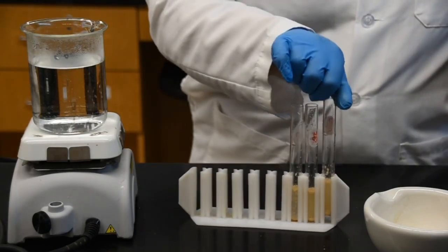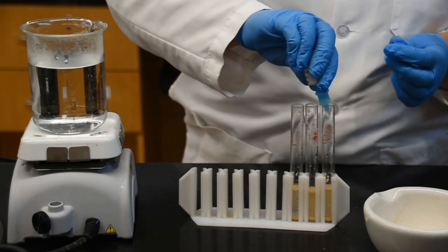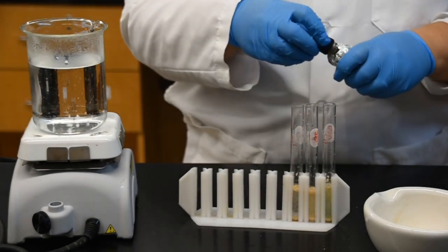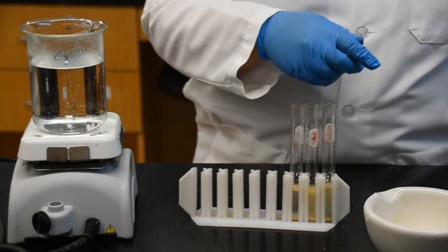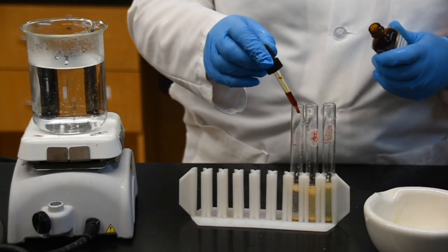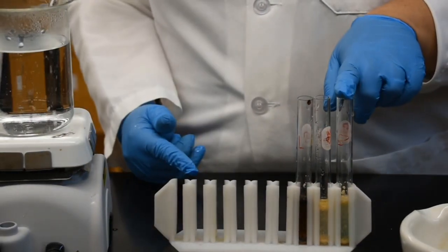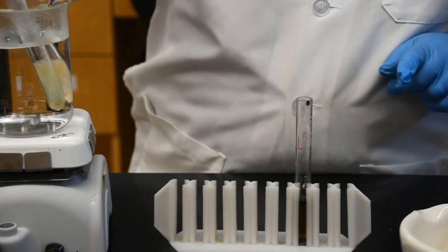Again, to the one that is labeled B, I'm going to add my Benedict's to see if there is simple sugar present. To the second one that is N, that's testing for protein, so I'm going to add my ninhydrin. And to the third sample, I'm going to add my Lugol's iodine to see if there is any starch present in it. Again, the ones for Benedict's and ninhydrin need to be heated, so I'm taking these samples, mixing them and placing them in water.